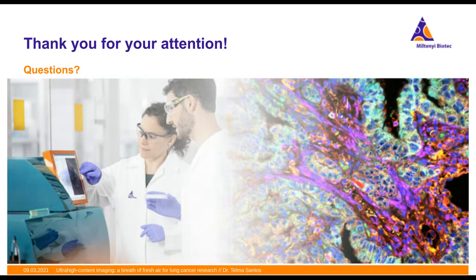Okay, thank you. Next question. Are these 2D whole slide images, or do you have to select an ROI before image acquisition? When you start the software, the Maxima will do an overview scan of the whole well, and there you can select one ROI or multiple ROIs or a very big region of interest. This is totally your choice.